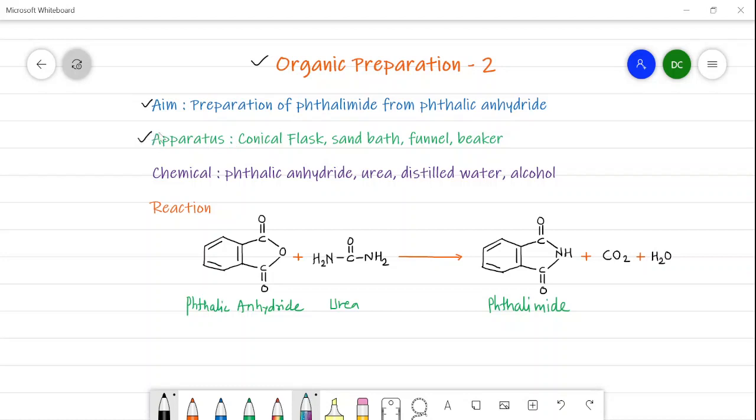apparatus such as a conical flask, sand bath, funnel, as well as beaker, and the chemicals like phthalic anhydride, urea, distilled water, and alcohol.